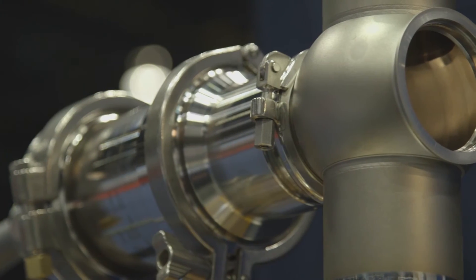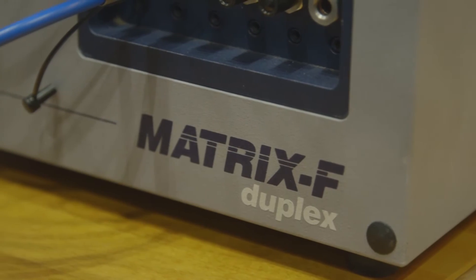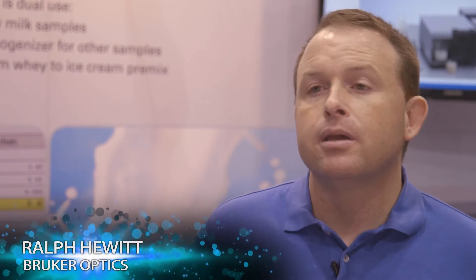The Q412 3A Certified Reflectance Probe integrates with the Matrix F spectrometer, which has multiplexing capability allowing you to connect up to six probes per spectrometer. These probes do not all have to be reflectance probes. You can mix in reflectance and transmission probes to measure your entire system, whether it's front, middle, or back of your dairy processing plant.